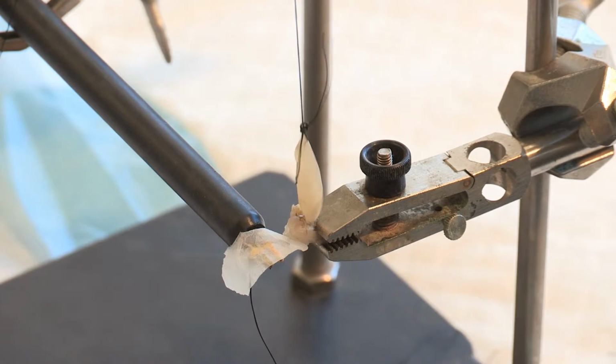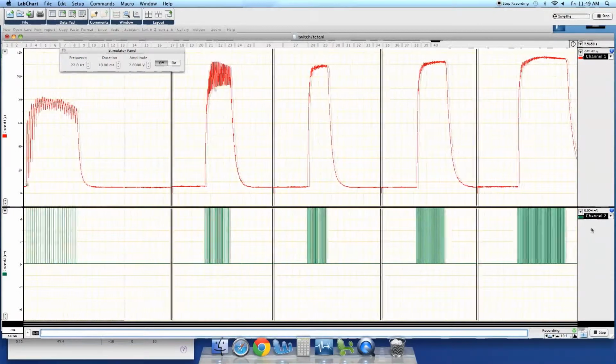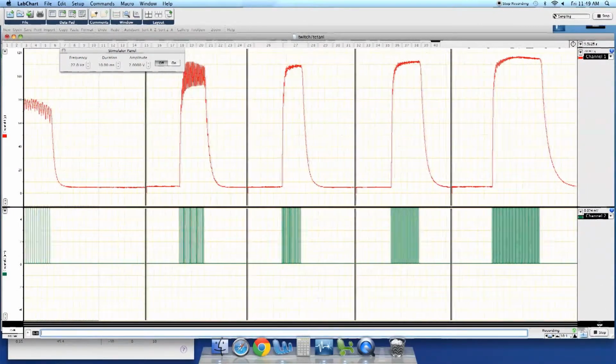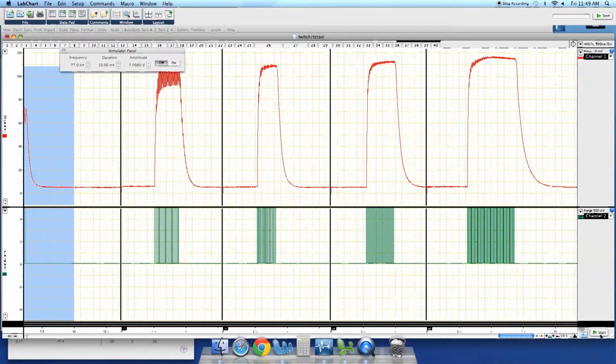Notice that the stimulation is much more rapid. These green lines indicate individual shocks that are delivered rapidly in succession. What causes these sustained, strong contractions? All of the calcium stores are being released into the cytoplasm, which allows for maximal cross bridges to be formed.